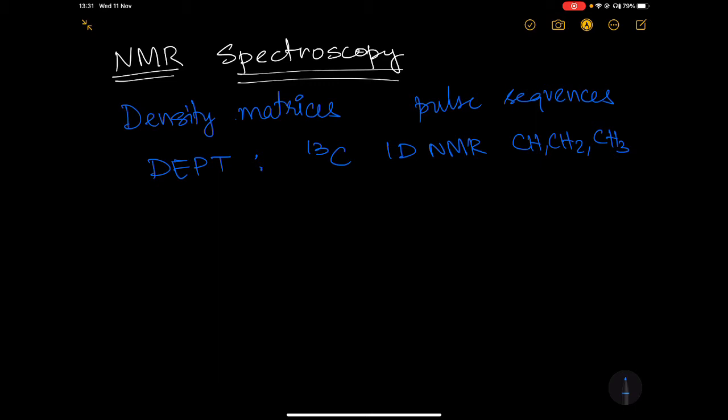Similarly, as we go forward, we will now try to understand how NMR spectroscopy could actually help you get even more information at a much higher resolution. One of the commonly applied extensions of NMR spectroscopy is acquiring data in a multidimensional fashion. Before going ahead to understand what multidimensional NMR is, in this lecture we will try to set the stage for understanding why we need multidimensional NMR experiments.